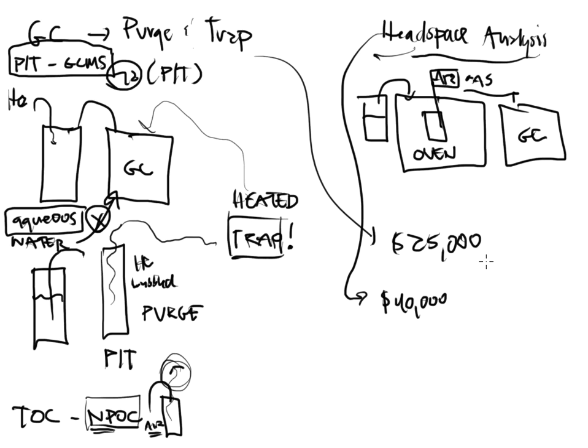In actuality, one of our GCs is a standalone with nothing else attached to it, and we use that for very simple samples and simple processes, especially in the very beginning. We have another GC that's a GCMS system, and the GCMS system does have the purge and trap attachment if we need to use it. So when we use purge and trap, we go to our GCMS system to get that done.